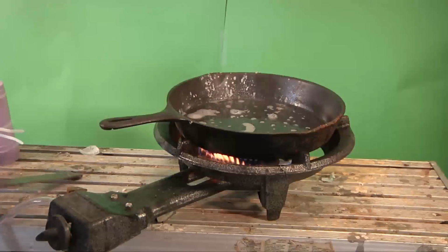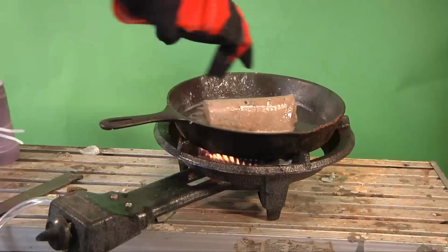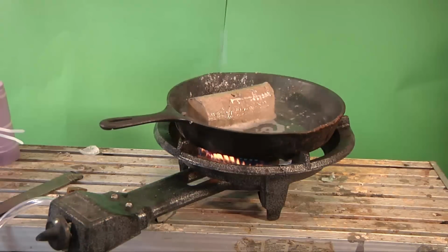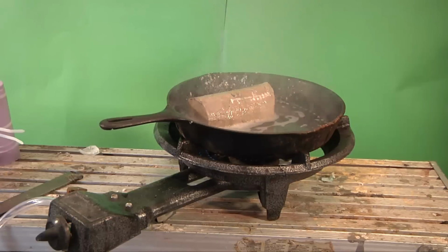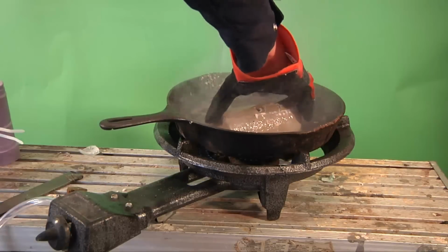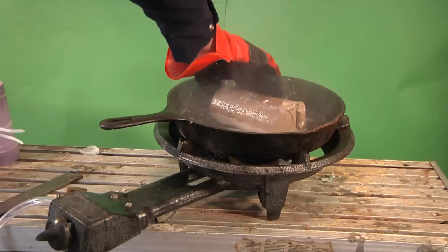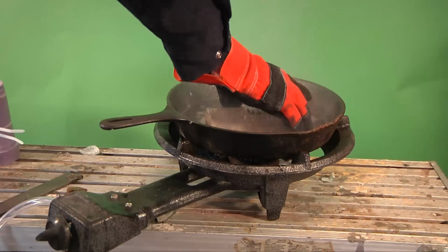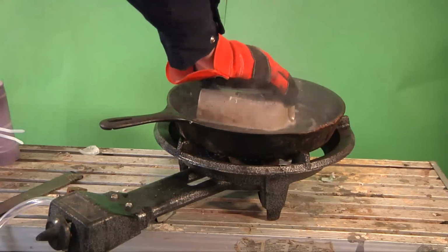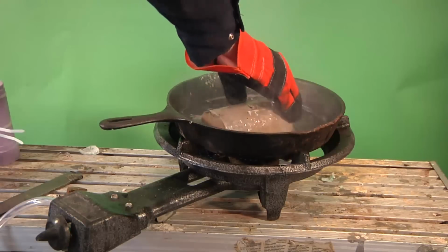So one of the easier things to do is we've got some oil and it's already been heated. Now we're going to use the oil because it distributes the heat evenly over this. Let me back the heat up just a little bit. And, just started getting hot. So the thing is you don't want hot spots. Sodium will ignite at just around 250 degrees Fahrenheit, which, you know, visually you can't tell a lot of difference between 200 and 250. So the oil does a couple things.